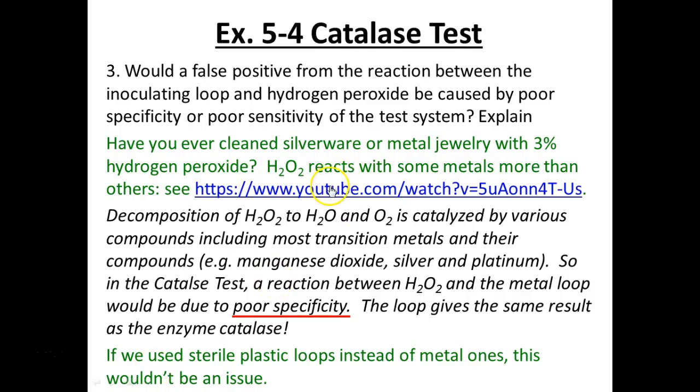This is actually a pretty cool video that Peter found. Metals will react with hydrogen peroxide and cause it to bubble. So you would not know if it was the metal or your organism causing the bubbling. This is the one example of poor specificity that we're dealing with in this lecture.